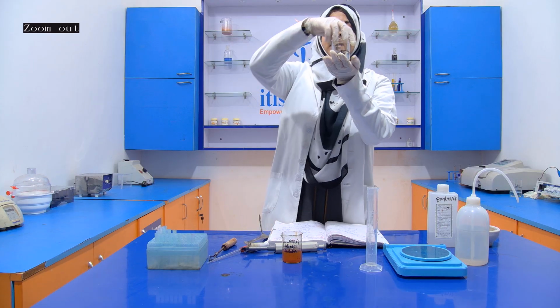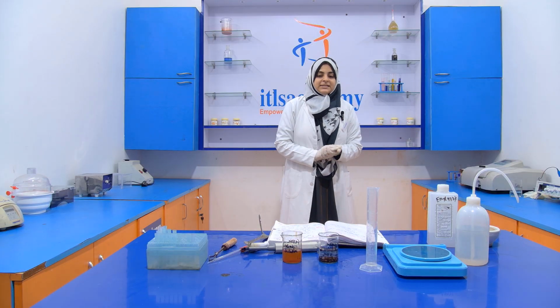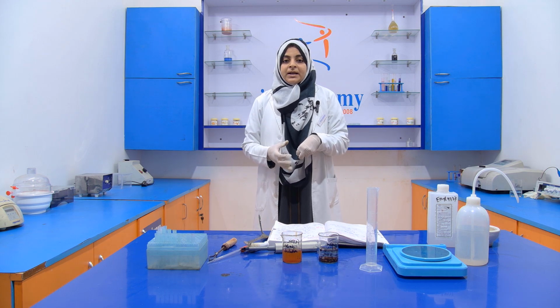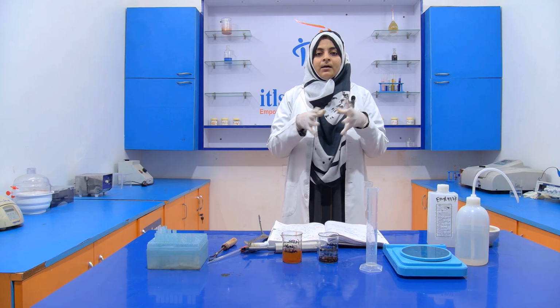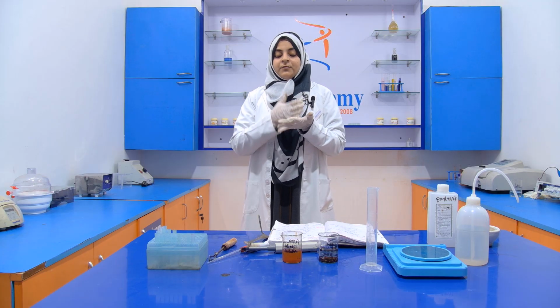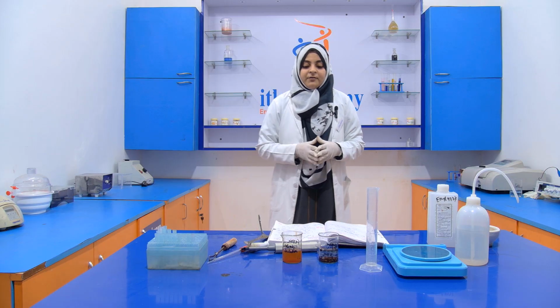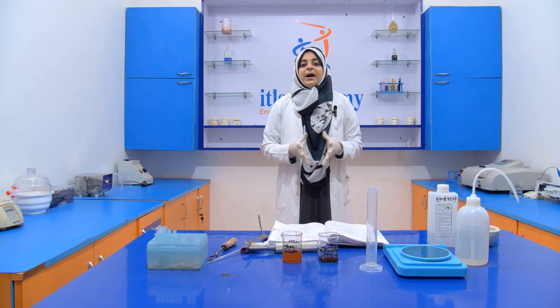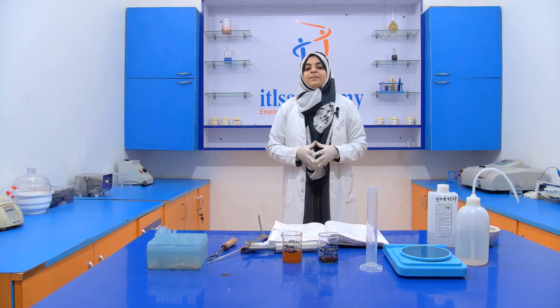All the black peppers sink into the ethyl alcohol, which means that our sample is pure. If it does not sink properly, then we perform the other part of the experiment, where we divide it into halves and then add that iodine solution. But here we get a negative result. So we don't need to perform the second part of the experiment, because now we know that our sample does not contain any papaya seed.